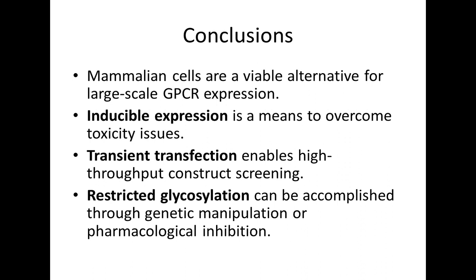The next person says, thank you so much. After the purification with denaturing conditions, is it necessary to do other procedures for the protein? So first of all, let me say that we do not typically use denaturing conditions when we purify. Usually we want to make sure that the proteins stay natively folded.